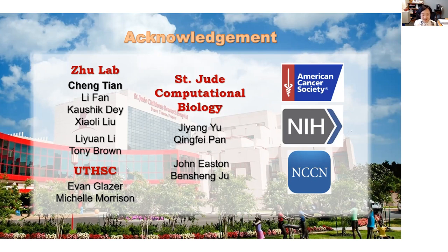So we have normal cells plated on the bottom and then tumor spheroids on the top. For that condition, especially if we're focused on non-hepatocyte microenvironment cells, those cells can be maintained in 2D condition very well. So for this 2.5D culture, we actually have some conditions up to 6 weeks, and the interaction is still ongoing, although we need to double check how well it models the in vivo condition. But yeah, the 3D hepatocytes have limitations, but the non-parenchymal cells can be maintained for quite long, up to, at this moment, 6 weeks, no problem.